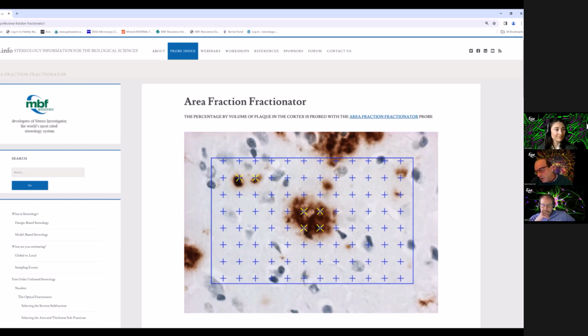So really, you can figure this out empirically. But what we know is that you're going to find out that you almost always need to use an oil lens to have good enough resolution in Z to have nice thin Z planes to optically be able to shave off the top of that cell.